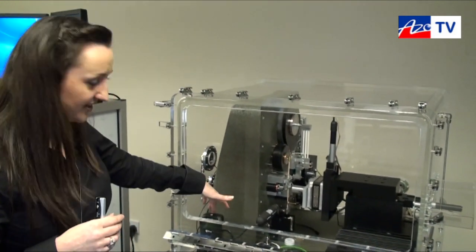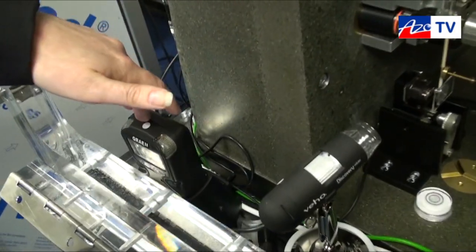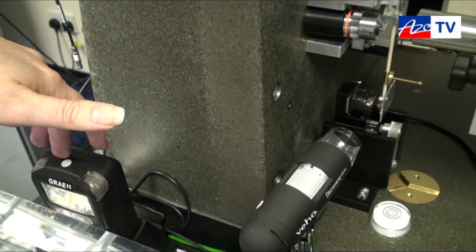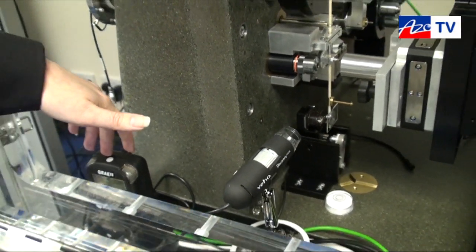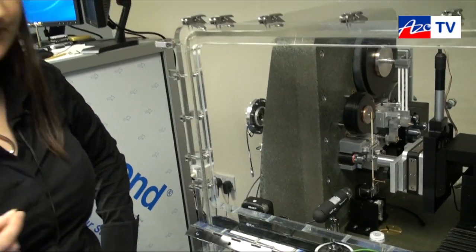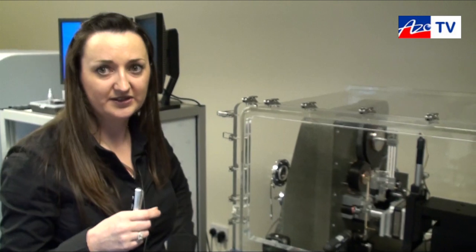So there's a little oxygen sensor here which allows us to read the oxygen levels in the cabinet. And this allows us to do high temperature measurements on even something like carbides, which are oxidized very, very quickly under temperature. So that allows you to do long duration high temperature measurements without the effects of any oxidation layer.